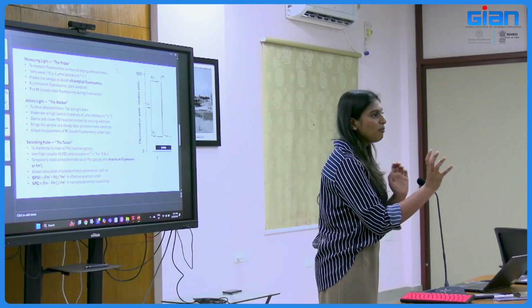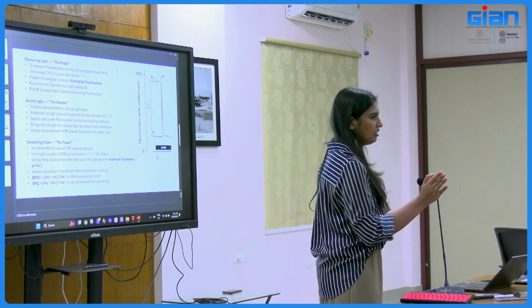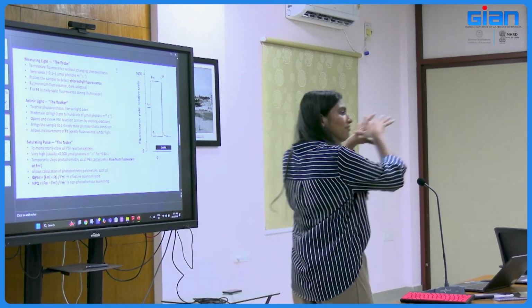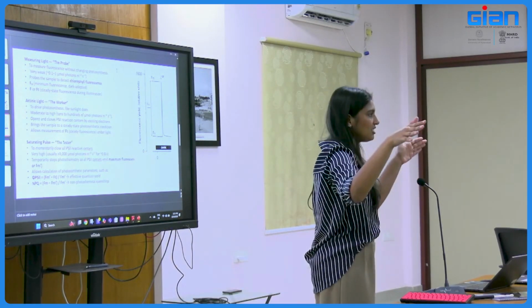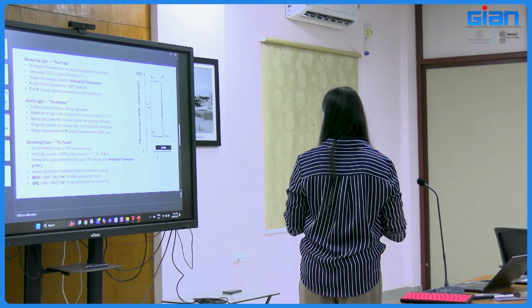So momentarily, the PS2 reaction centers completely close, and you temporarily stop the photochemistry because you are giving a very high intensity of light. Everything is saturated now. You are giving that much high intensity everywhere. That's why it is called a saturating pulse. And this stops the photochemistry.